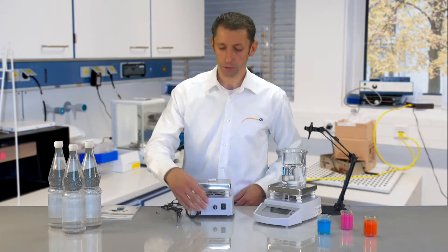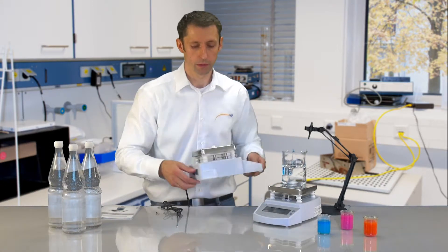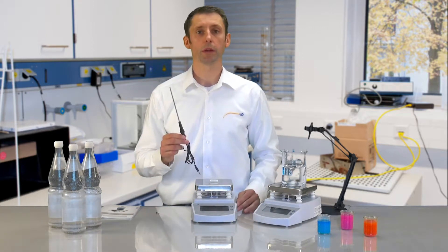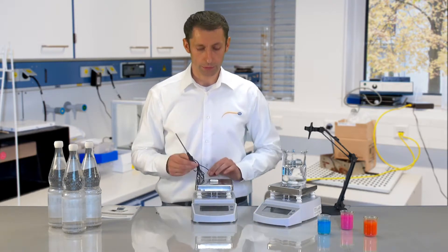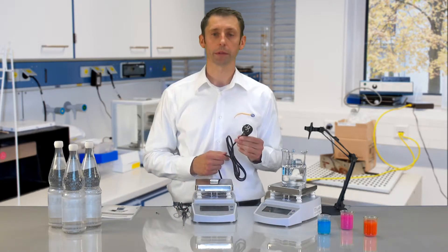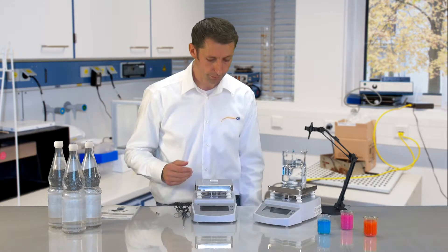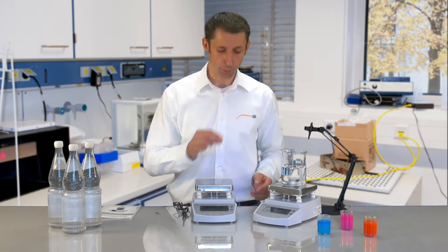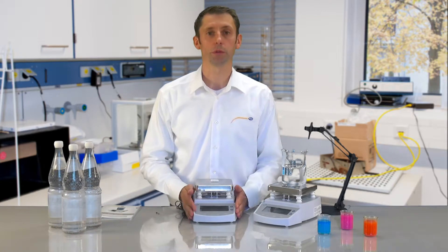The construction of the magnetic stirrer is very simple. You connect the temperature sensor, after this plug the magnetic stirrer into the mains, sink then the stirring rod into the probe, and then you can start your measuring.